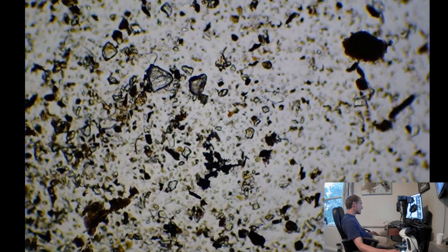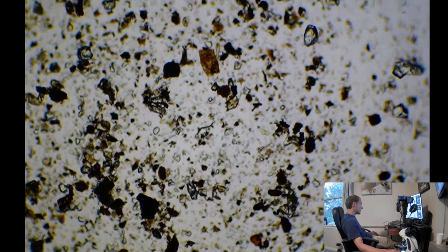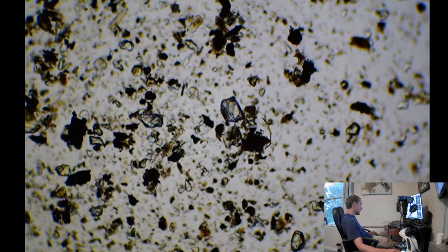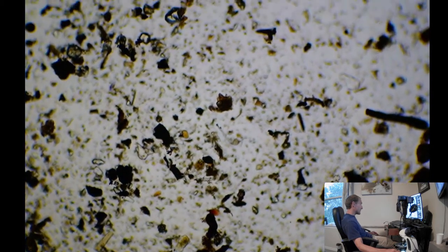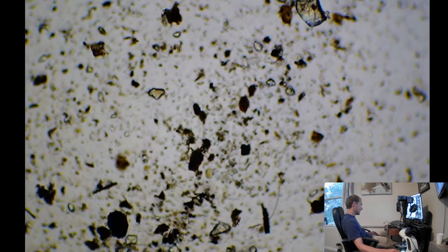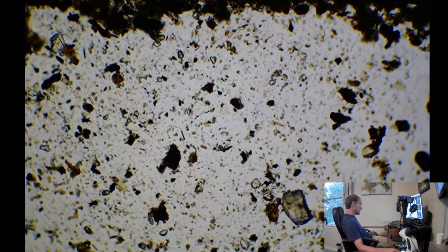This part of the slide's a lot more busy. A lot of nice aggregates over here. Still some big chunks of sand and whatnot, but we did add a little bit of sand into the soil. Just a little. And a little clay for the macronutrients or micronutrients or whichever one it is.